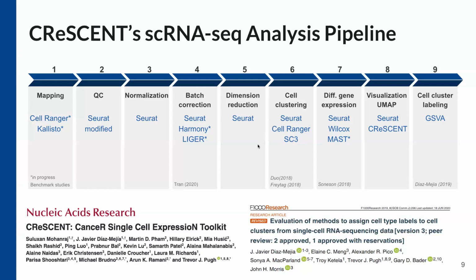Dimension reduction. We have a huge matrix of tens or hundreds of thousands of cells with 3,000 up to 30,000 genes. So you have this huge matrix that you need to reduce with PCA in order to actually have some kind of valid visualizations, which we will do with cell clustering and UMAPs and tSNEs and all that kind of stuff. So I'm not going to dive too deep into what UMAP is and stuff.